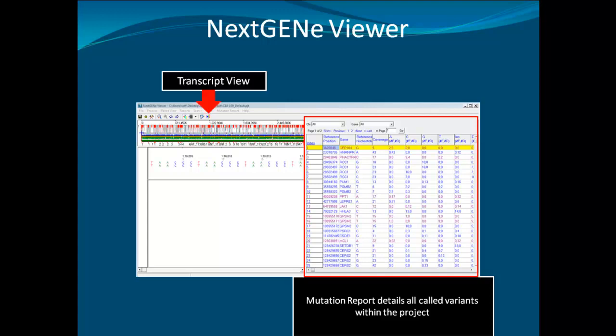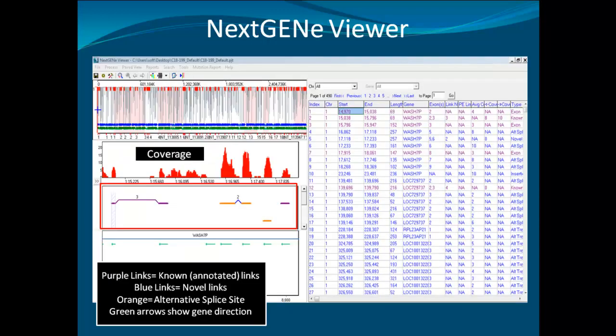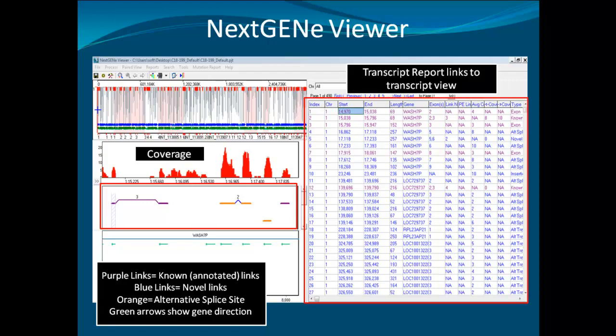The viewer will automatically switch over to the transcript view display. The purple links are known, based on annotation. The blue links are novel, and the orange links are alternative splicing. The transcript view now displays a transcript report, which is also linked to the transcript view, so you can click on any variation in the report and the transcript view will jump to that position.